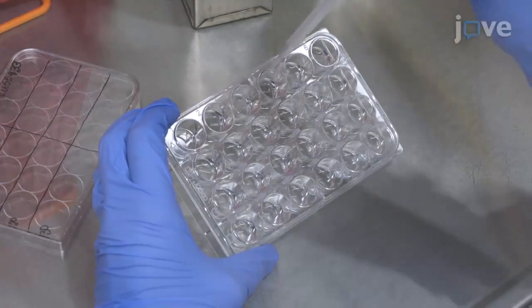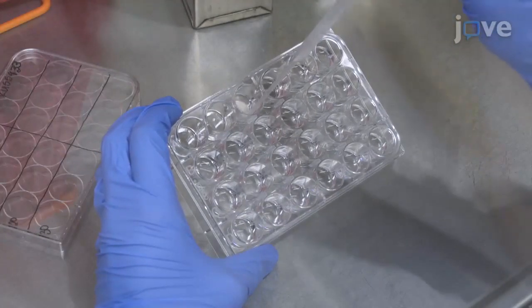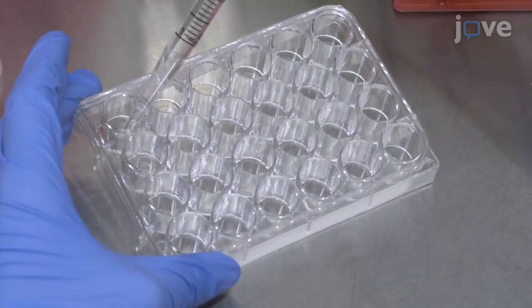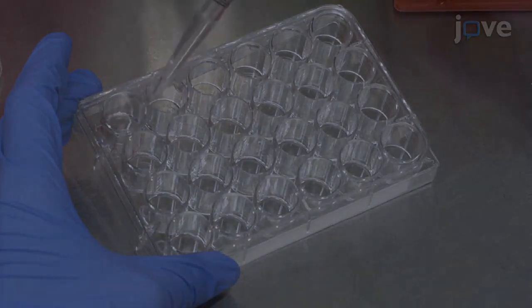Then, remove the plate from the incubator and aspirate the fibronectin solution from the wells. Wash the wells three times using 500 µL of 1xPBS per wash.